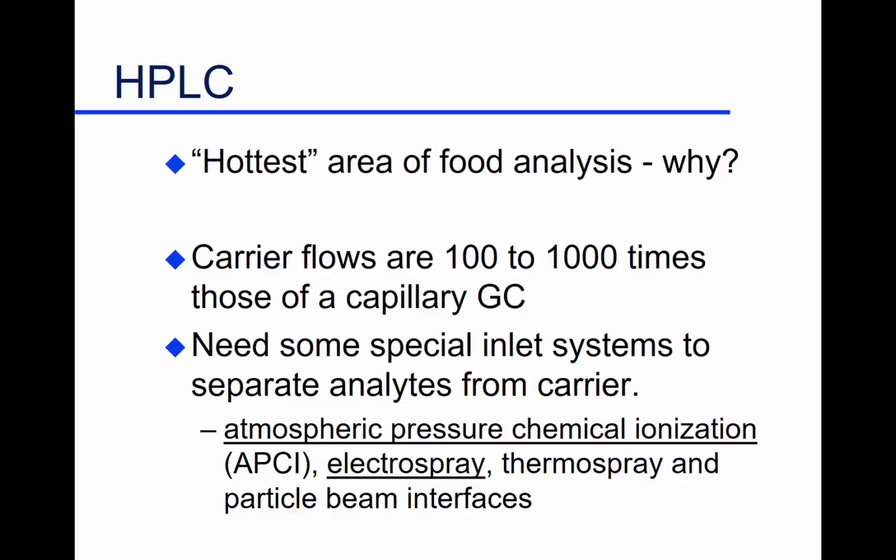I've said gas chromatography is mature. We've met and matched all theoretical possibilities. LC is not there yet. It is still in the development stage. It has progressed a great distance also, but there's still room for improvement. People for a long time have had gas chromatographs, but LC and LC-MS systems are more recent. So there's really a lot of opportunity here for improvement and for application in our industry.